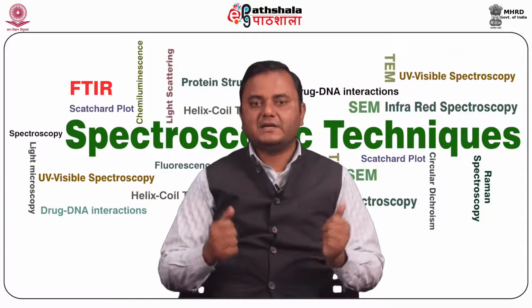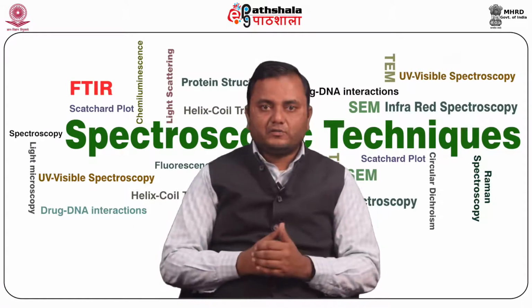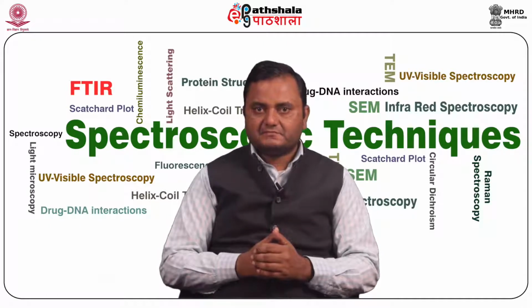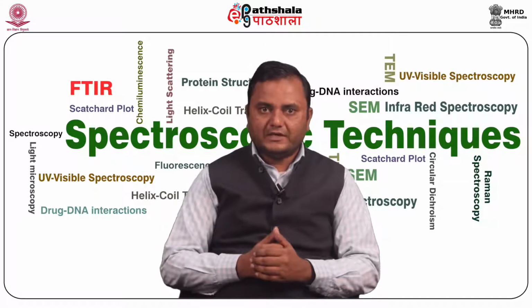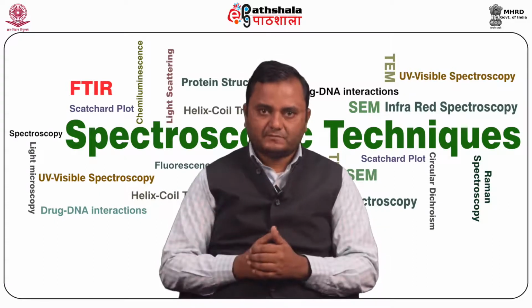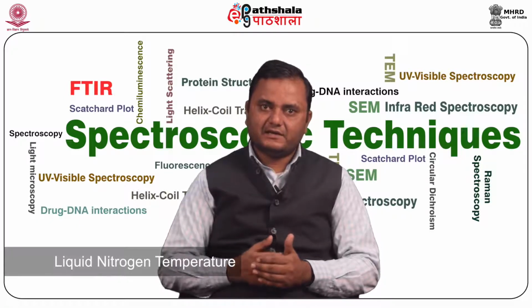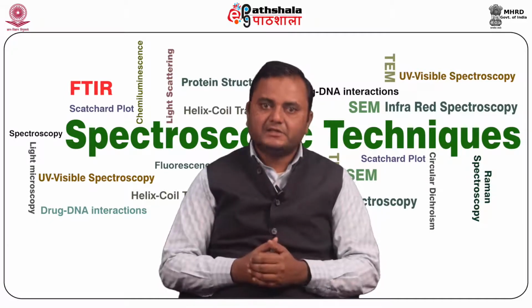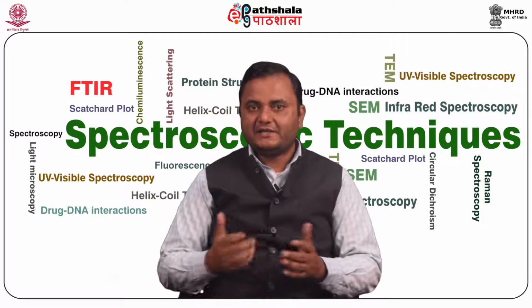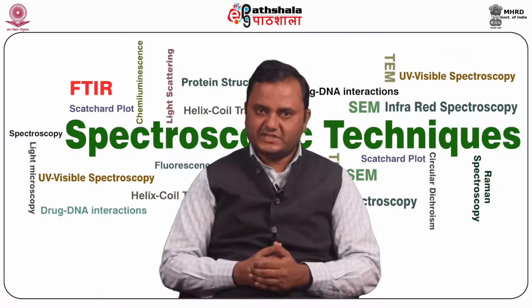The second is mercury cadmium telluride, MCT, a photon or quantum detector that depends on the quantum nature of the radiation and also exhibits very fast response. It must be maintained at liquid nitrogen temperature, around 77 Kelvin, to be effective. In general, the MCT detector is faster and more sensitive than the DTGS detector.